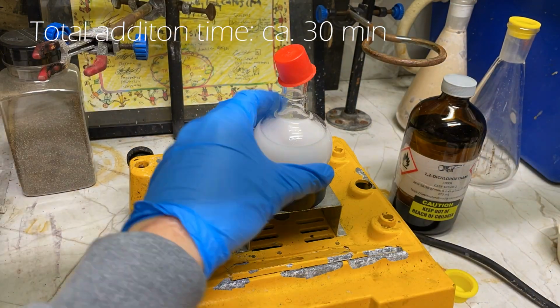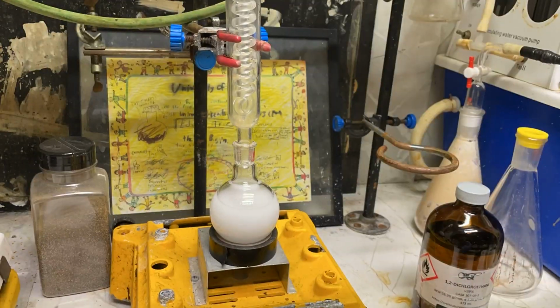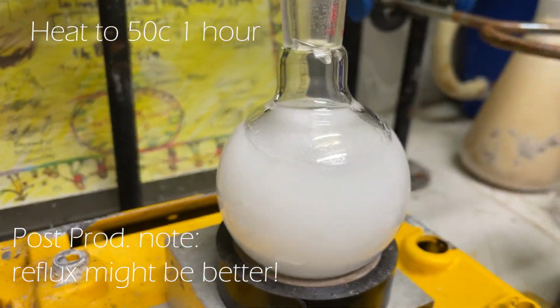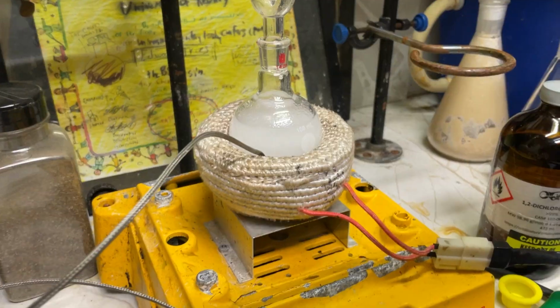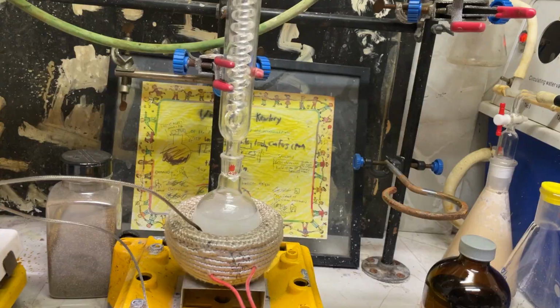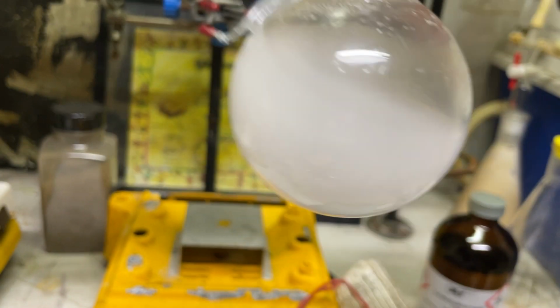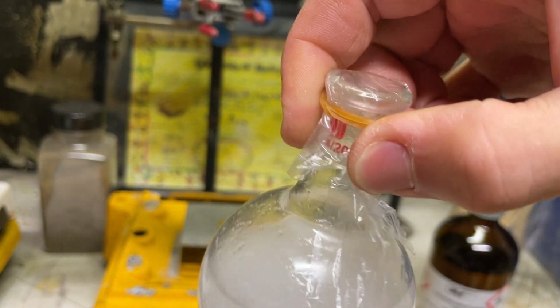It's kind of fun. So this addition took me about half an hour to do, and then in the end I put an air condenser on it because it is getting hot, but honestly you don't even have to cool this reaction. And then I brought it up to 50 Celsius for an hour, and this is to drive it to completion. I also did stir it overnight, but I don't think that did much, but you can do that if you want. And here's the solution. You can see the sodium triacetoxyborohydride is not actually fully dissolved in it, it's more of a suspension, but it has this nice pearlescent effect.